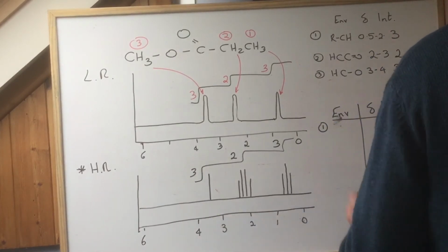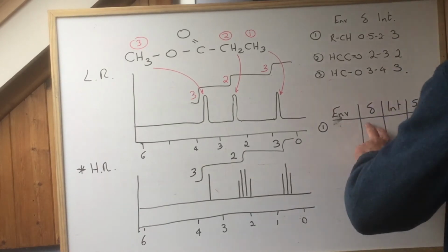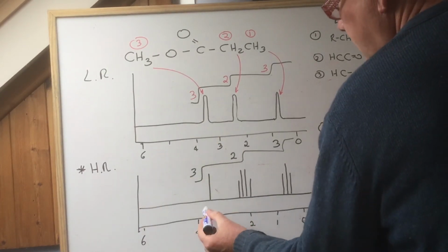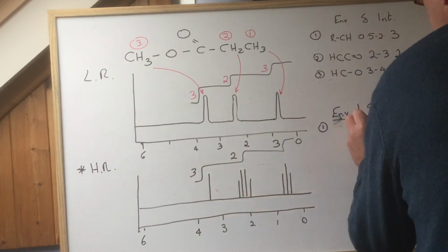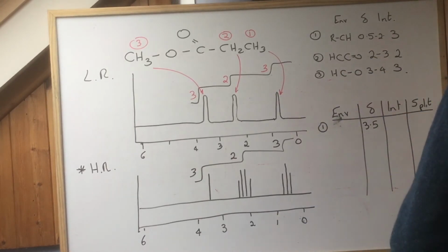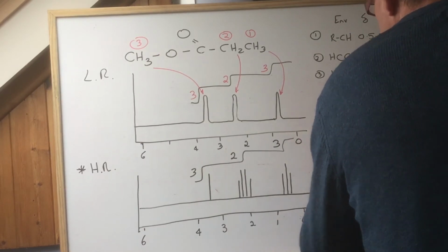3 to 4. So environment, you probably in the exam start with the chemical shift. Now you've got to be precise. I'm on exam mode now. So that is, never mind the range, 3.5 chemical shift. You look at your data sheet, 3.5, that says HC single bond O.